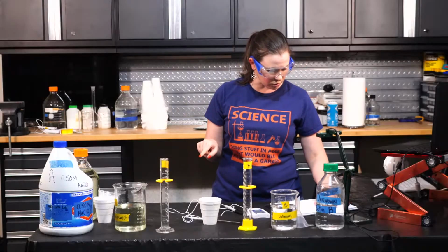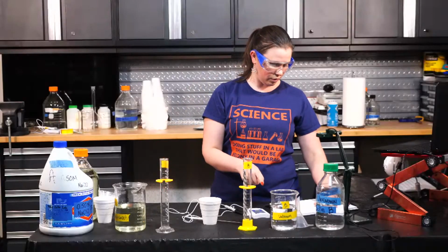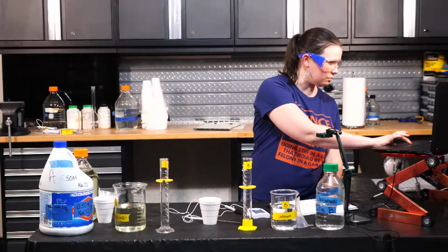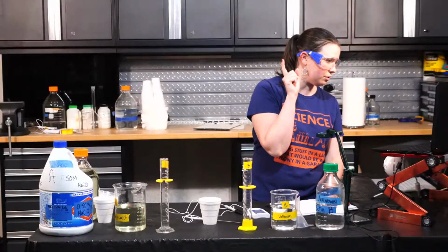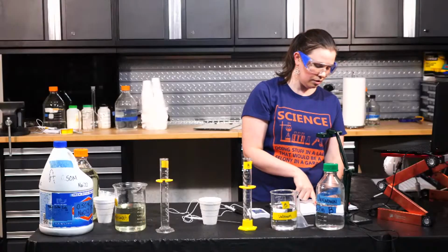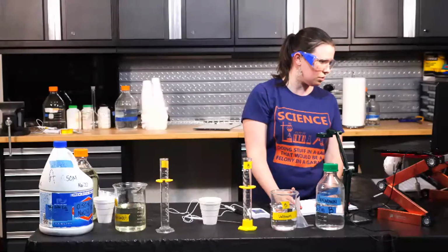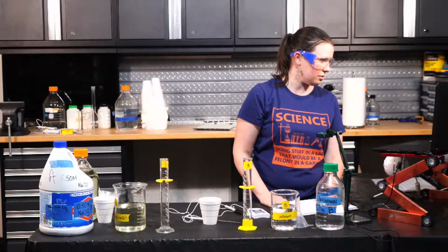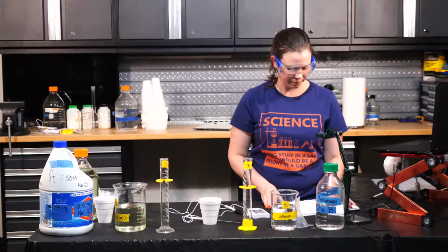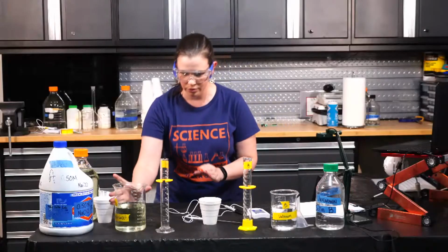For level 2, it's going to be 15 milliliters of bleach with 35 of solution B. Did you hear what I just said about how I can't measure 5? I have a 10 milliliter graduated cylinder in my room. I just have to go get it. So can we still use 5? Yeah. I just figured I would skip that one for now and give you guys some data to start working on, and then I'll do that one last. Does that work? Okay. So we'll do 15.